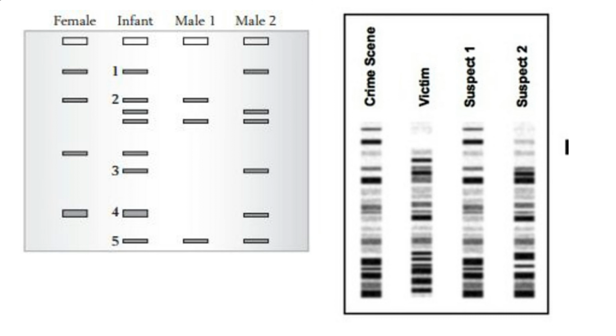You can see that mom and the infant are sharing some similarities here. See how they match up? Here and here and here and here. Now again, this baby is not a clone of mom, so it's not going to have the exact same DNA. But is the infant more similar to male 1 or male 2?